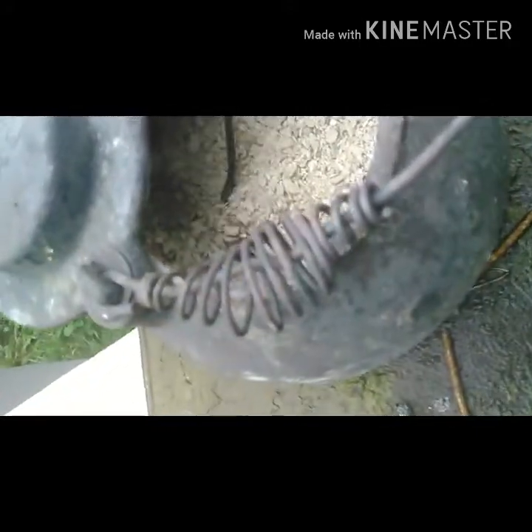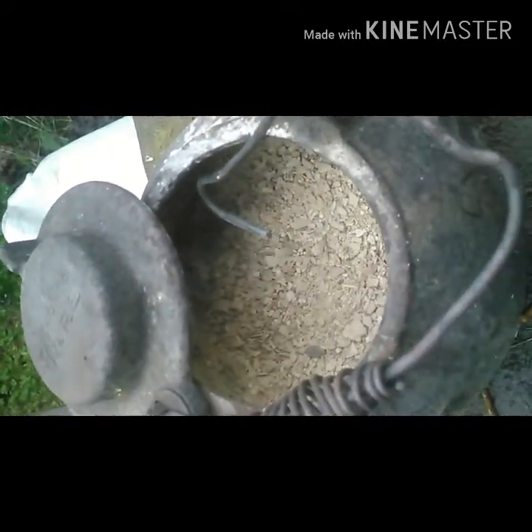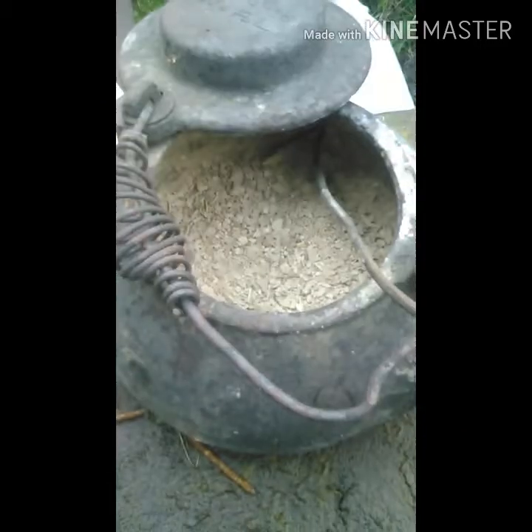That's how you make litharge without adding any kind of chemicals. I literally took it from the battery, rinsed it with water, put it in this pot, and cooked it in a kiln fire — and stirred it a couple times. That's it, that simple. Until next time.